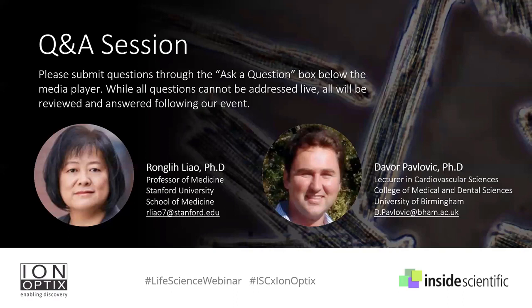Rongli, do you have anything to add to that? Yes, I completely agree. When the heart is really fully digested, it almost falls apart in front of your eyes. So you can quickly use tweezers to really tease apart the tissue, and the cells will just come out. And that will be the best way.